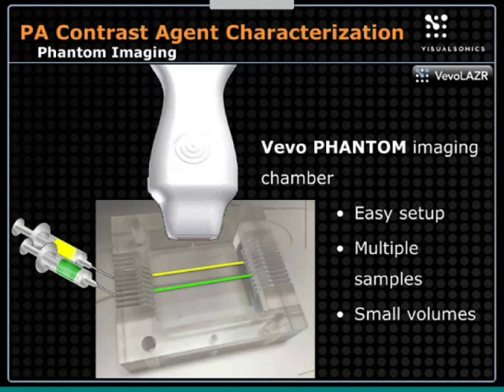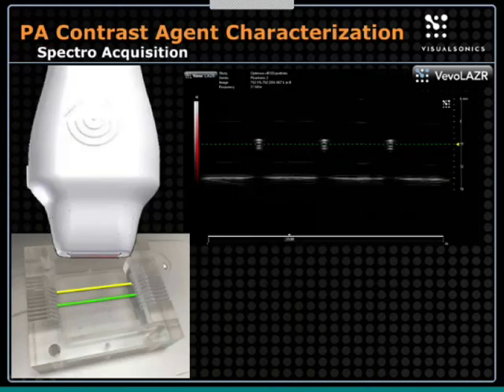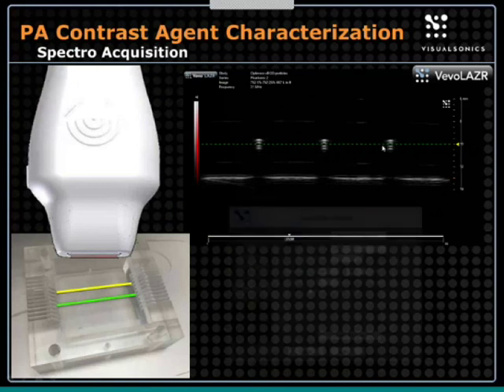and then we image it with our system, with our regular probes. Okay, so this represents our two different types of contrast agents here, and this is the kind of image you get. I really should have 3 different tubes here because we were imaging 3 different contrast agents: 5% PAR 762, 25% PAR 762, and then the yellow PAR 867. So we've provided this guide in the software where we can line up our tubes. You're now looking at cross-sections of these 3 tubes.